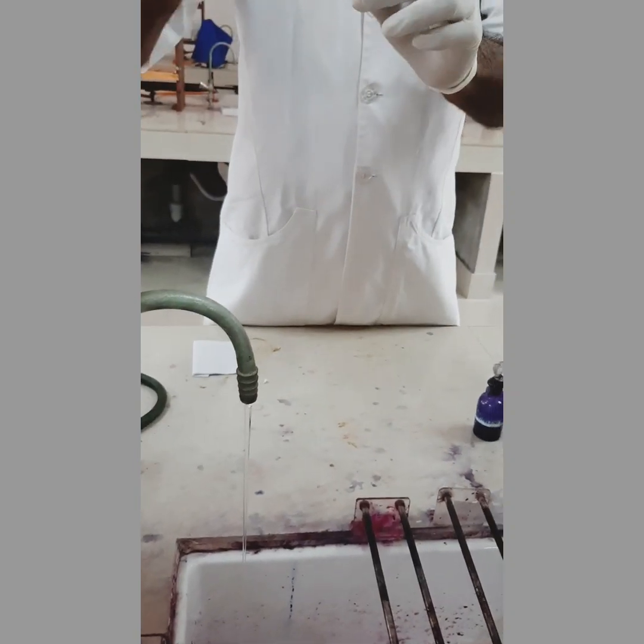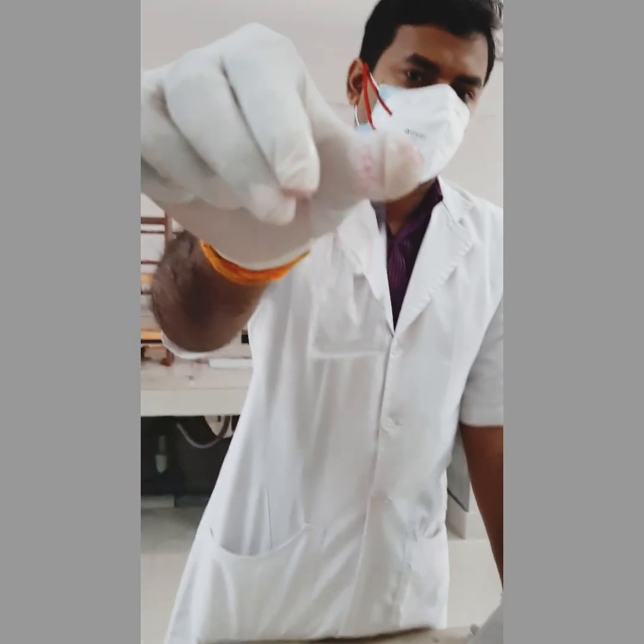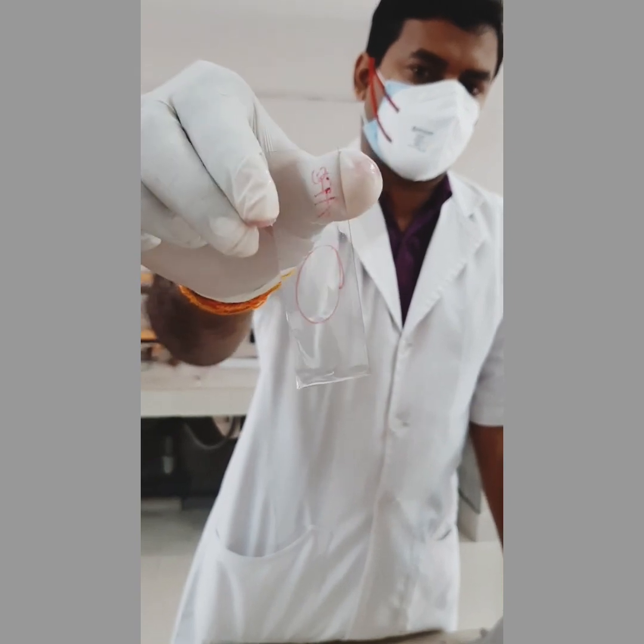Then wash with water and check the smear. Now it is clear, there is no pink color.